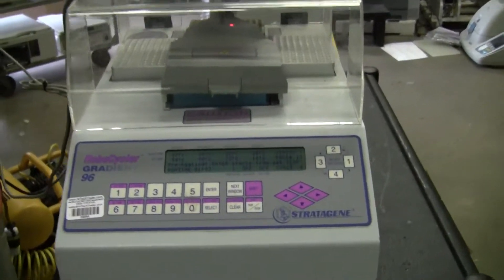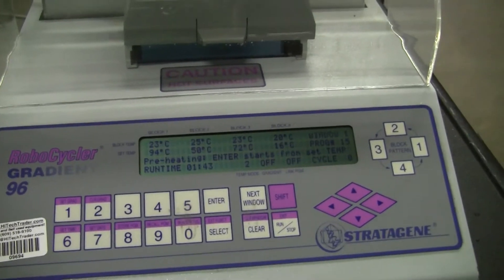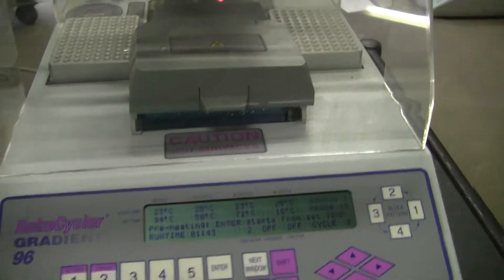Hi, this is Michael Naitow from HitechTrader. Today we're looking at a RoboCycler. This is a Stratagene Gradient 96 well plate unit.